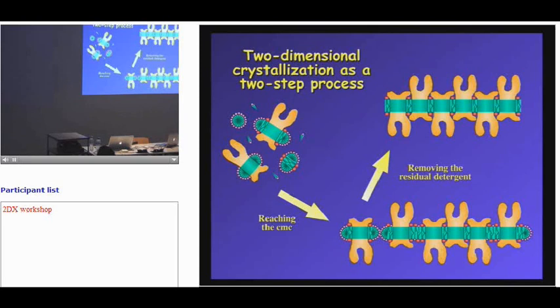So how 2D crystallization really works is kind of elusive to me. And do you agree with this? Right. I mean, this is a picture we usually draw. Perfectly correct. But already the first step is a very big question. How are you sure that when you have your protein completely delipidated, you will get back lipids onto the protein? And most of the bad cases are when your lipid goes its own way, maybe.